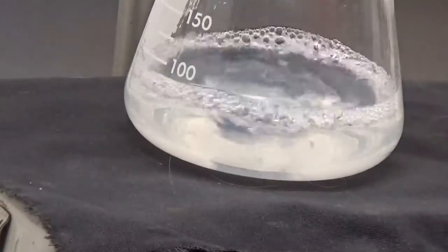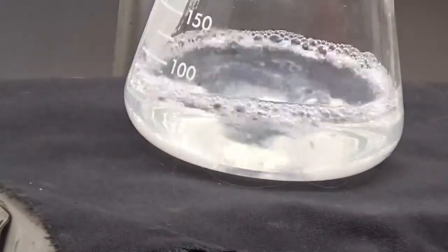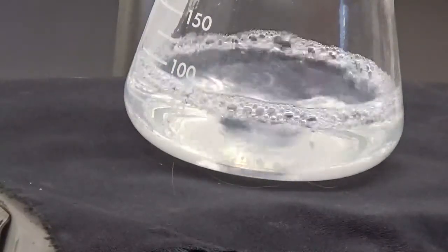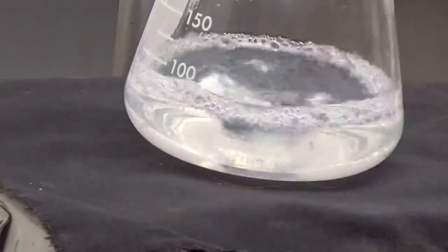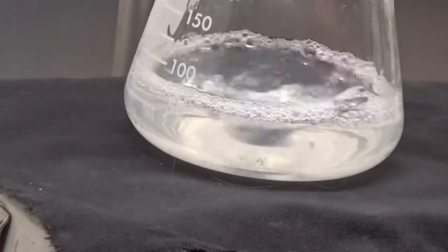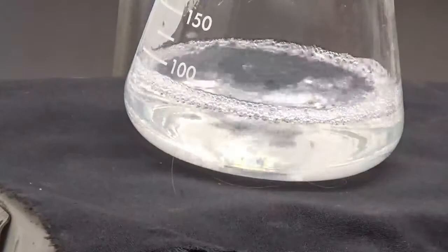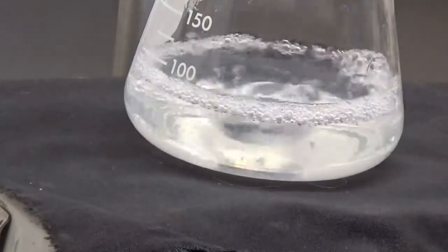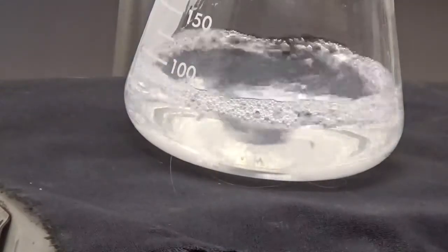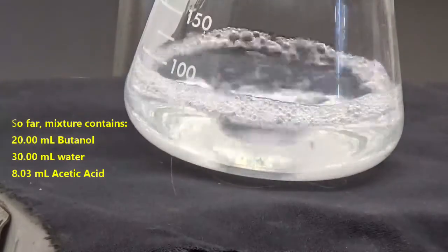Wait, I think I maybe need one more drop here. One more. That's pretty clear, so I'm going to get the reading. Okay. It's like 8.03 milliliters.